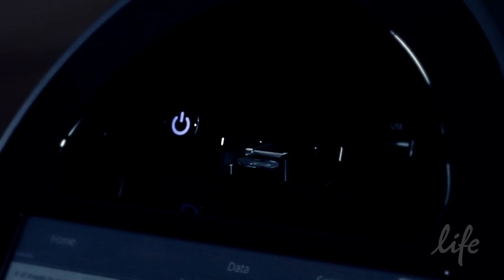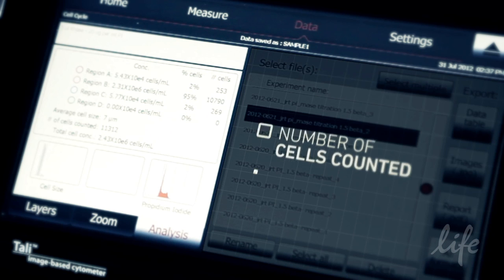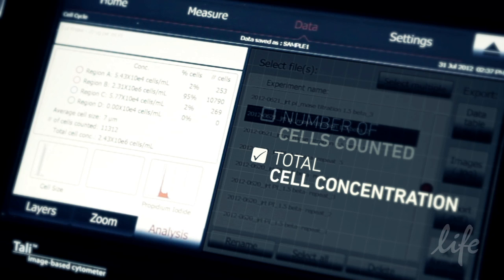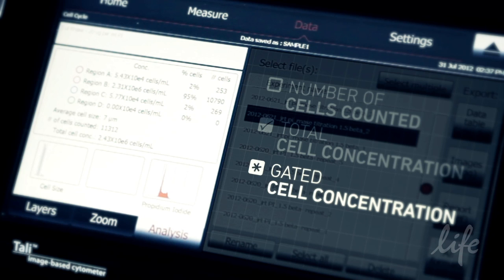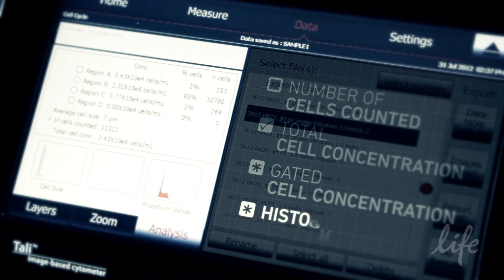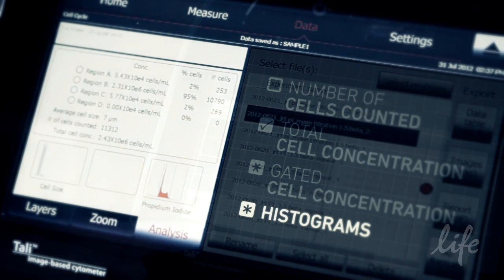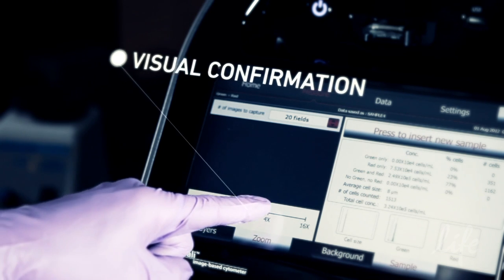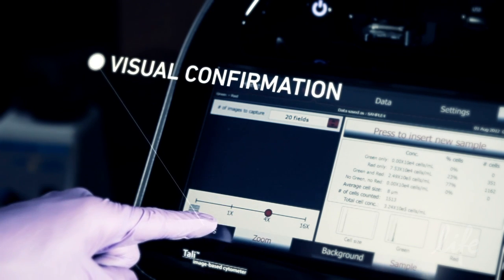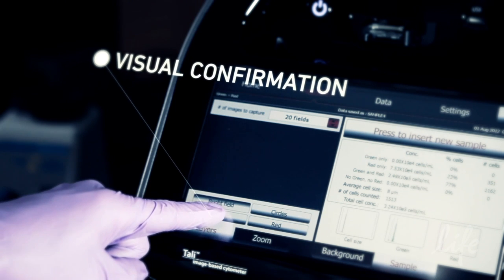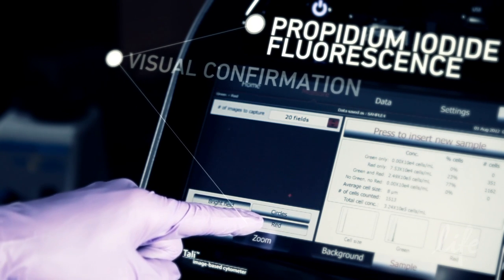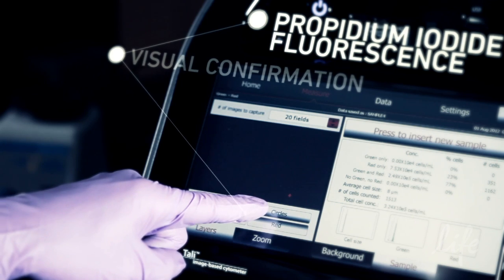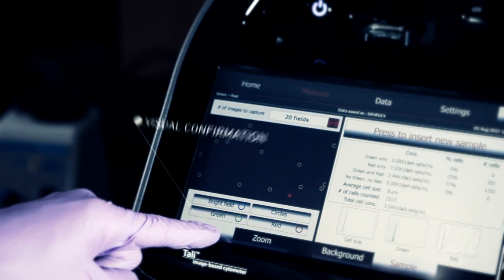The cell cycle assay specific data includes the number of cells counted, total cell concentration and cell concentration within each gated region, as well as the histograms for cell size and propidium iodide fluorescence distribution. The results can also be visually confirmed by examining the images of the captured fields of view. The cell cycle assay on the Tally allows simple yet powerful analysis of the stages of cell cycle within a population.